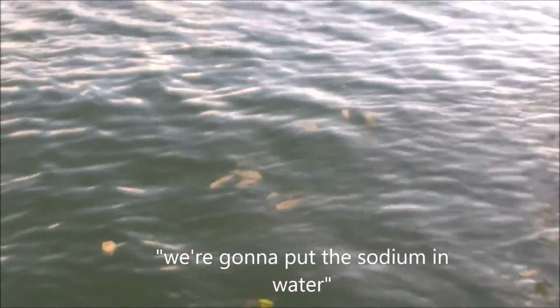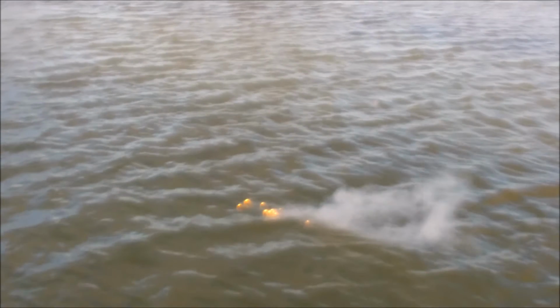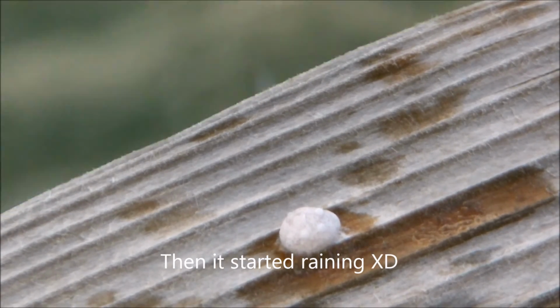Okay, so now we're gonna put the sodium in the water. Into a ball. Yeah, we just need a drop or two. Come on. Oh, wow. Nice. Gnarly. See, told you.